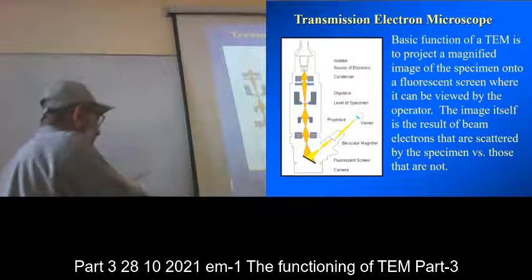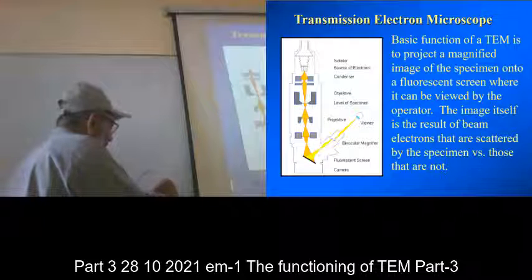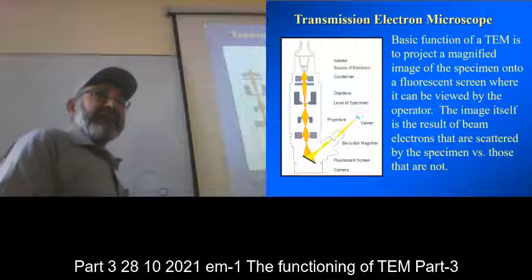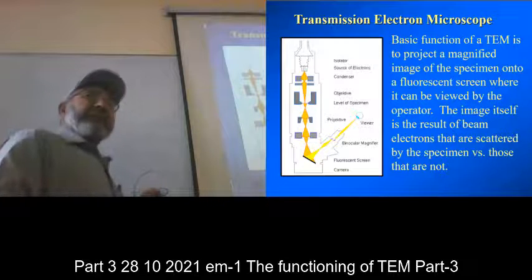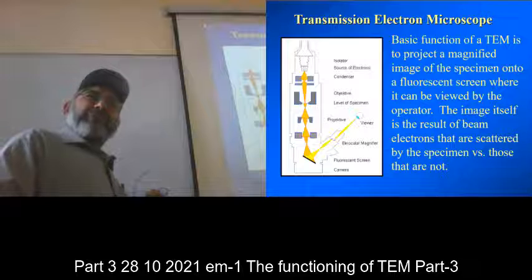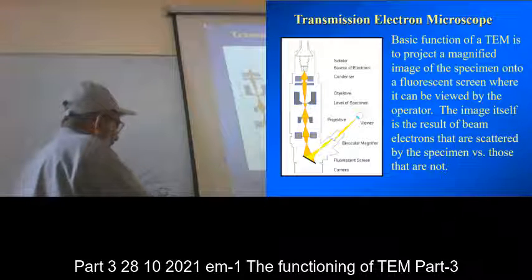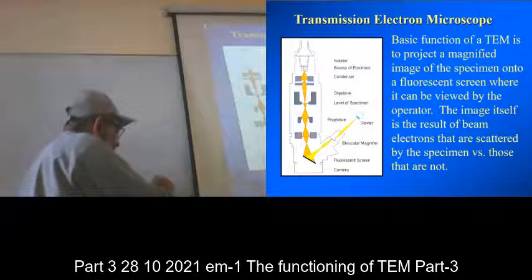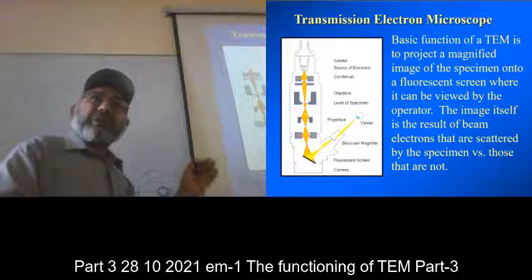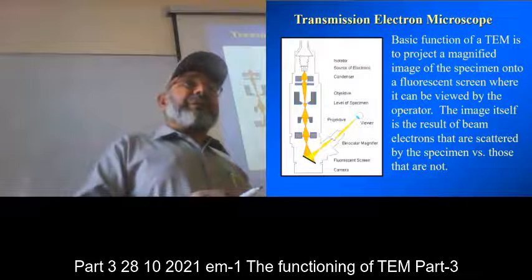You have a screen like this, and in the middle you have a small screen. So if you are interested in very high magnification, then instead of this whole area, you pick up this screen and take this bit of the image and you look into it with a further higher magnification.